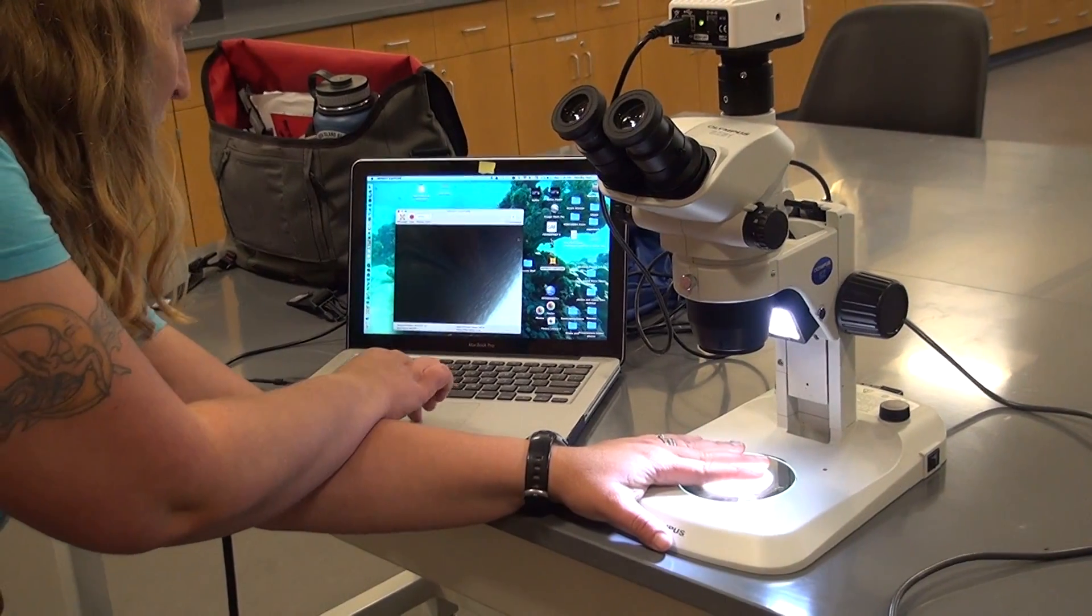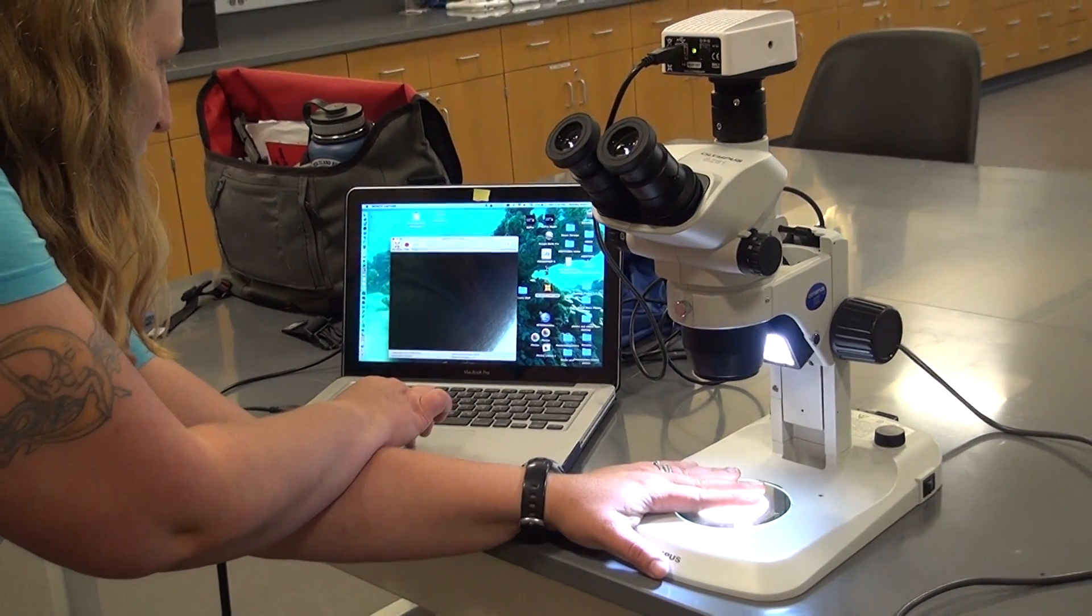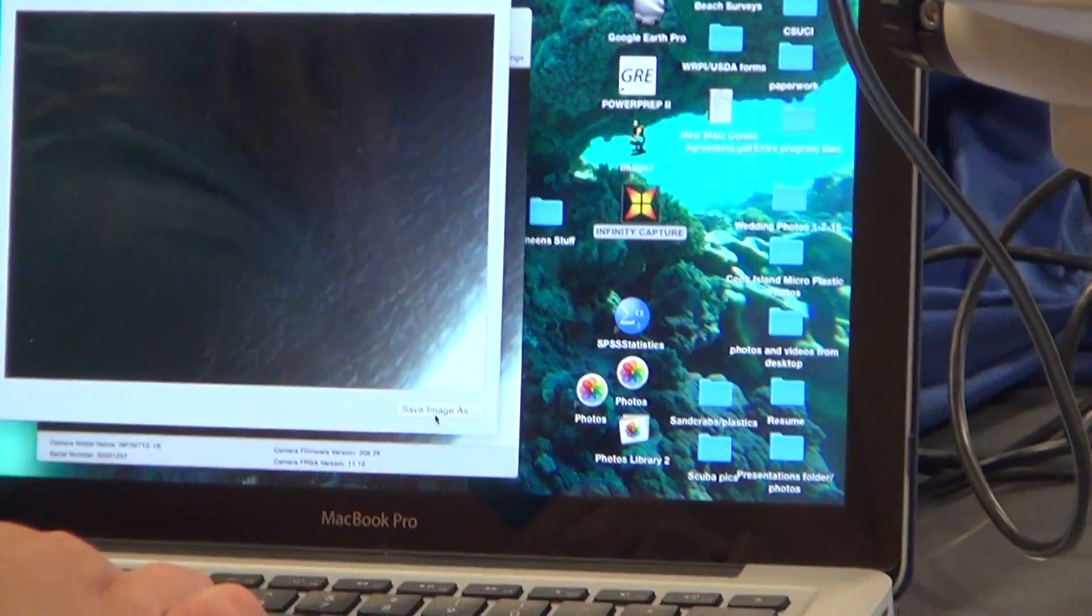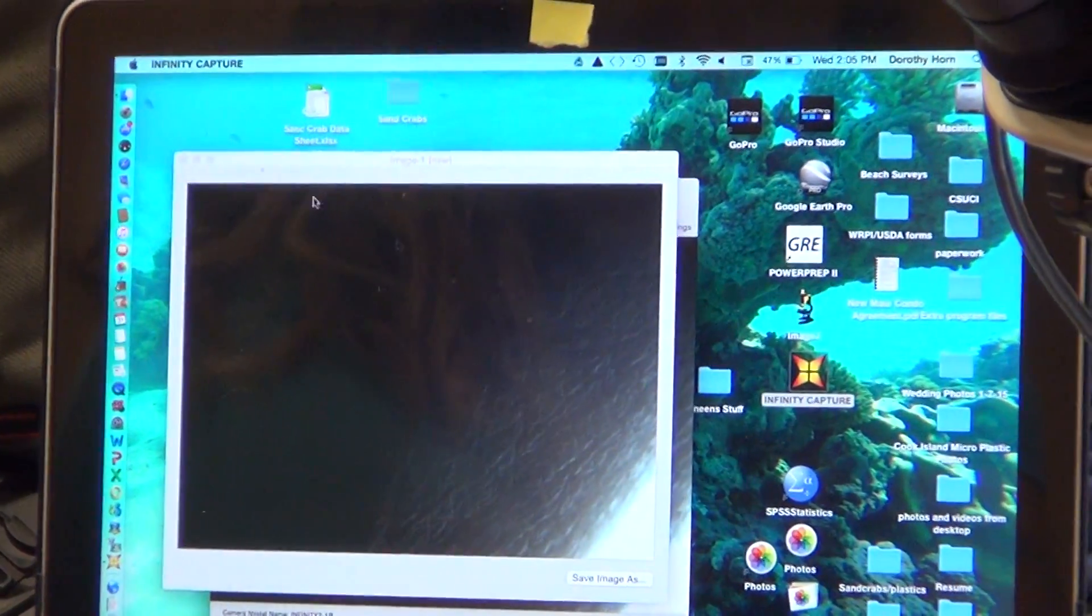And then when you want to take a picture, you take your arrow, and you click on Still Image. And it takes a picture, and then you can save your image as whatever you want. You can save it on your desktop, etc.